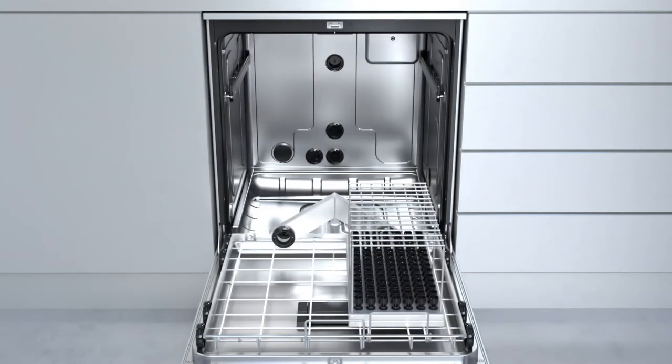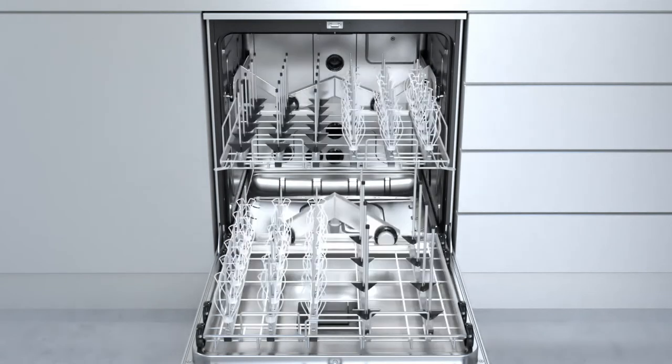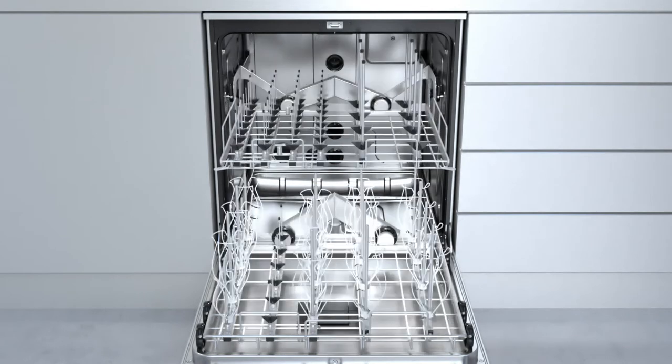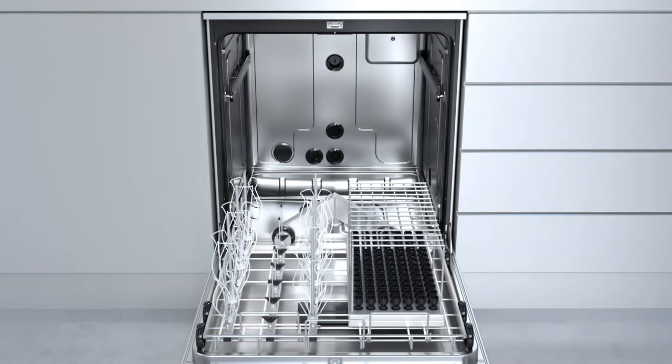More combination options with fewer accessories. Thanks to the new sophisticated design with just 17 modules, more than 100 combinations are possible. This reduces both procurement costs and storage space.